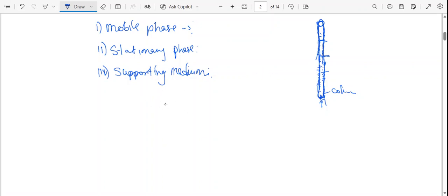So the basic terms that we can also find are these: we inject a solvent in this. I'll demonstrate, and as the days go, we'll be able to show you the analytical column, which is the chromatography column. I'm sure I'll have a chance to demonstrate that in other segments of this lecture. So the first basic term that we find is adsorption.